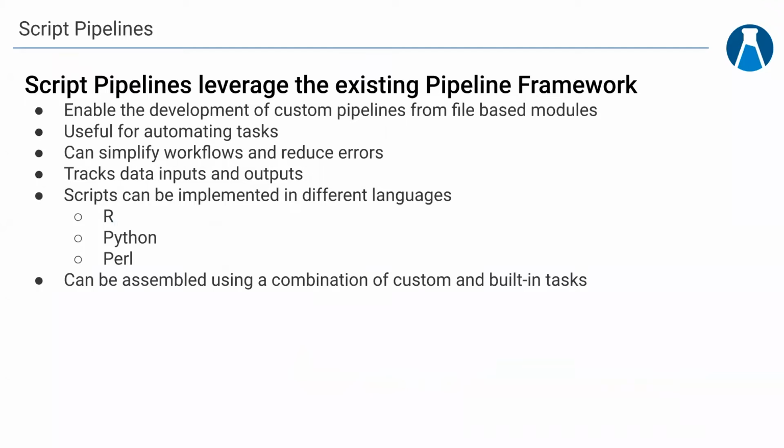So the script pipelines that we're going to talk about today operate using that same base pipeline. However, they allow the development and easier deployment of pipelines, even from our file-based modules. They leverage some naming conventions and other things to help simplify the workflows.